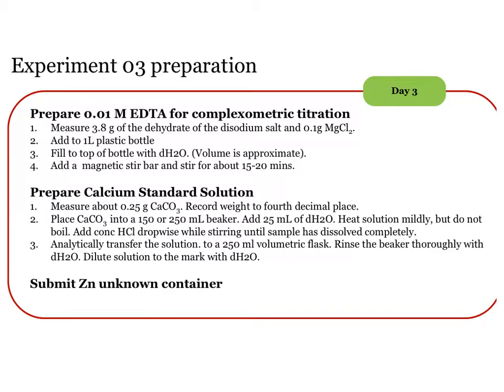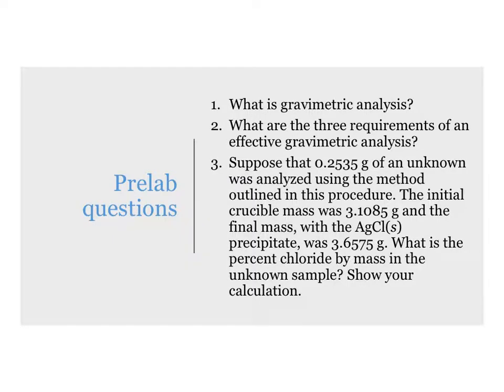On the last day of Experiment 2, you will prepare 2 solutions needed for Experiment 3. So prepare an EDTA solution and a calcium standard solution. Also, please submit a zinc unknown container. From this video and the Experiment 2 procedure, you should be able to answer these questions. Please submit them on Canvas before coming to lab.